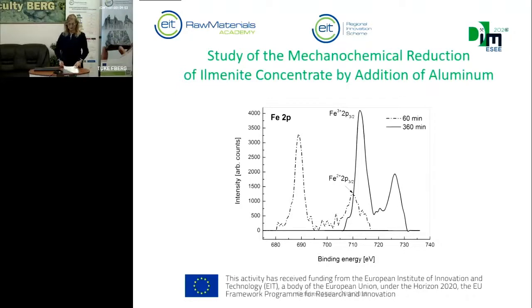Now I have some questions for students, because I explained the principle of the XPS method. I would like to ask the students if it is possible to measure liquid or gas materials by this method.